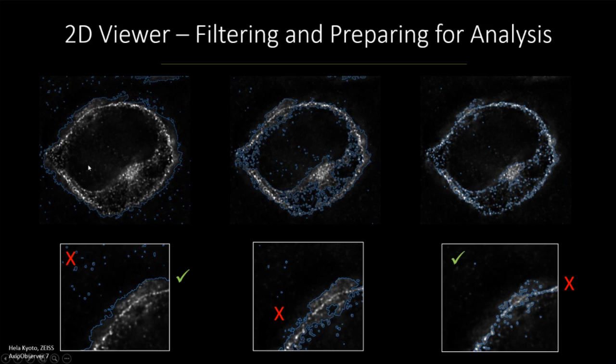What happens is, if we try to do something like an intensity threshold, we kind of start to get the border of the cell based on this out-of-plane light here. And we also get lots of background objects. I show you here, we're getting background objects. We kind of get what is roughly the border of the cell. And this may be good enough in some cases, but in some cases, maybe it's not.